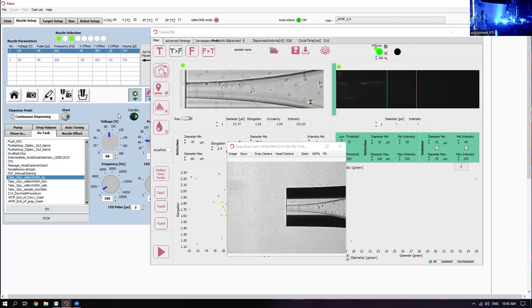There's a number of different ways to set that up, and depending on what the population is, it may make sense because it's all sequential. You're not getting all this imaging data at once. For what we're doing here, where we're looking for negative in the green and positive in the transmission, we'll look in transmission until we find one that meets those criteria, and then we'll check our fluorescence. If we're looking for something expressing this RFP, we look for that in that one channel, find one, then check the next condition, that it's not dead in the green channel, and then check the transmission condition.